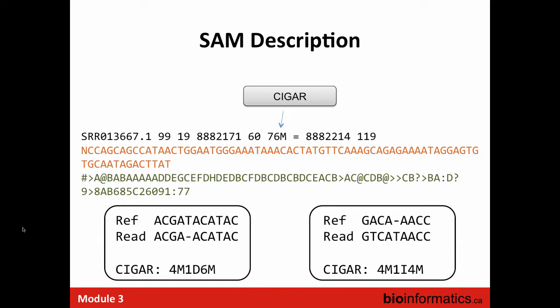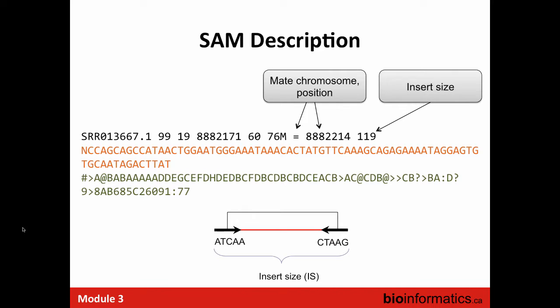And that's something that people commonly get confused about early on with working with these files, is that they want to treat these 4Ms or 10M or whatever it is as an exact match.